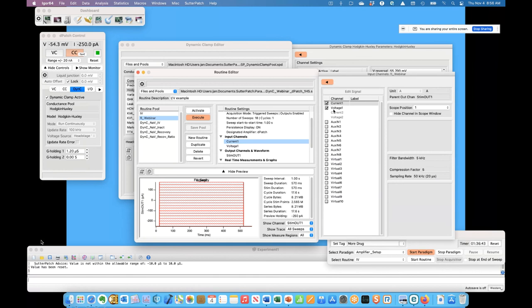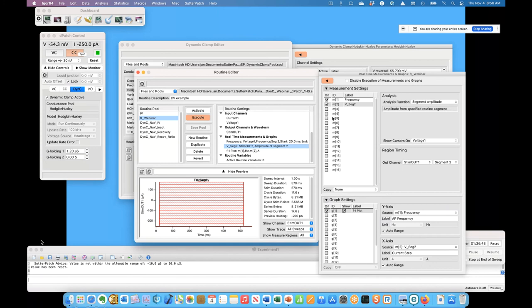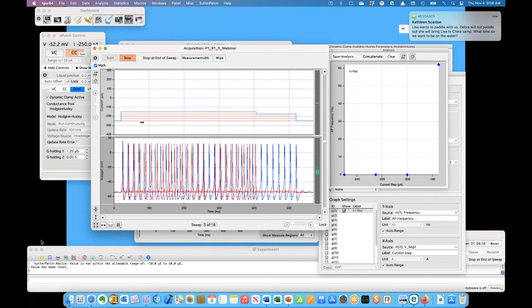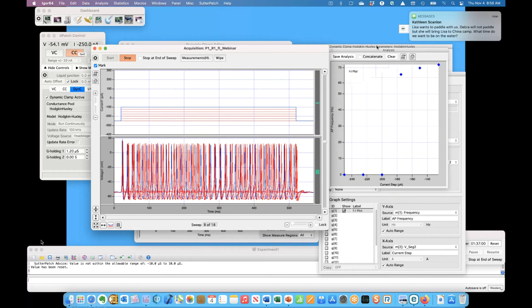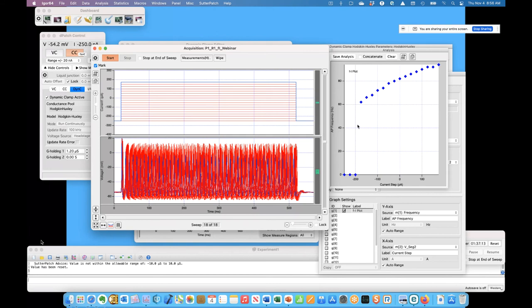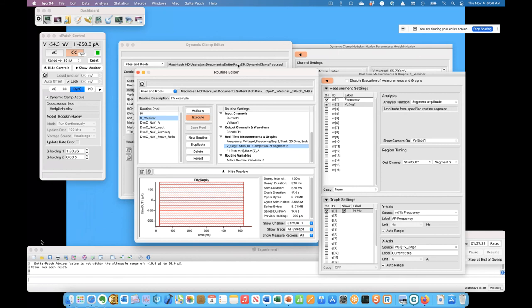The second thing I was going to show you was running an FI plot. So here are my current steps of increasing amplitude. I'm recording the current and the voltage signal. Here is my stimulus out. And then in real time, I'm plotting the frequency versus the segment amplitude here. And if I run this, it looks like this. Up here are my current steps. And down here are the action potentials. And here the frequency is plotted in real time, starting at about minus 200 picoamps. I get a relatively high frequency.